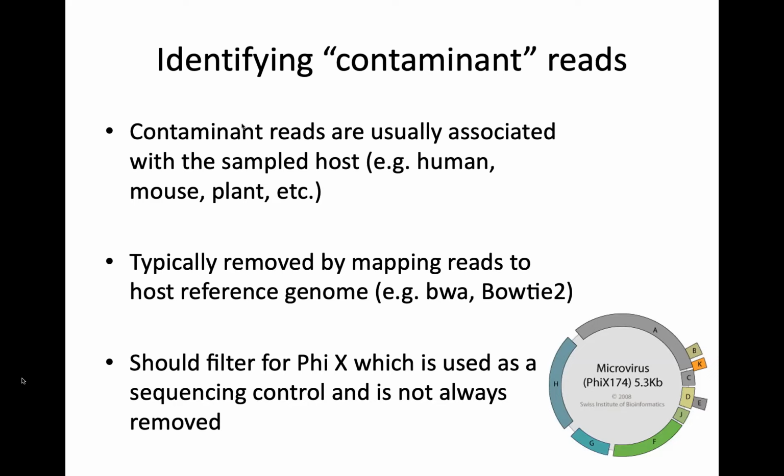The fun fact is that if you try to get those to agree, 16S and the metagenomic profiles, they won't agree very well. They won't actually, because also taxonomy is a problem there, right? So we're talking about Silva taxonomy is actually just fundamentally different than say NCBI taxonomy or the GTDB taxonomy, at that level. But then you also get differences just because of potential biases and the tools we use. It's uncomfortable, but that's the reality. So the quick answer is no. Typically, if you're going to do metagenomics, you would just do it by itself.